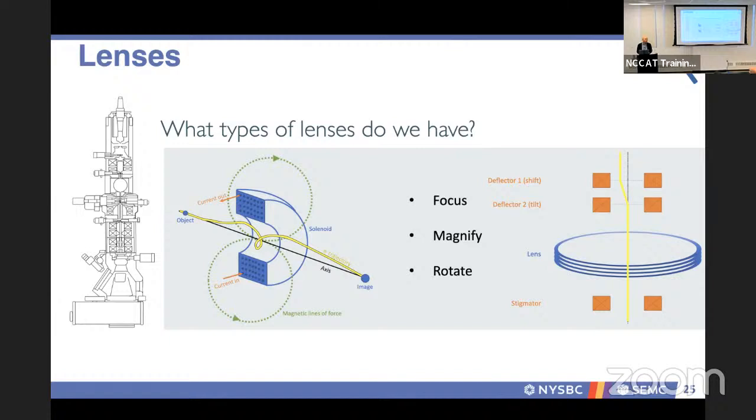The lens system in a normal TEM has defined magnifications. You can have continuous mag if you sort of hack the system, but what you notice is your image will start spinning. So you would be wondering, why do I have that mag or that mag? If you had an intermediate mag, if you think about it, if you have an electron going through, you'll have a rotation. And so then you would have to calibrate that. So that's why the manufacturers have set mags, and they align that so it looks coherent as you're trying to do multi-scale imaging.